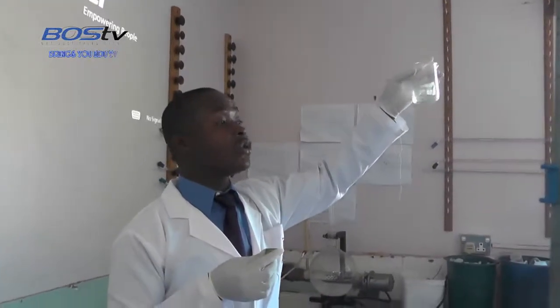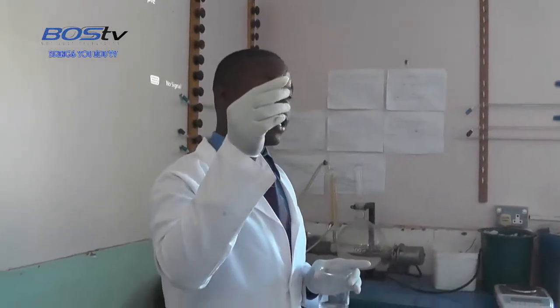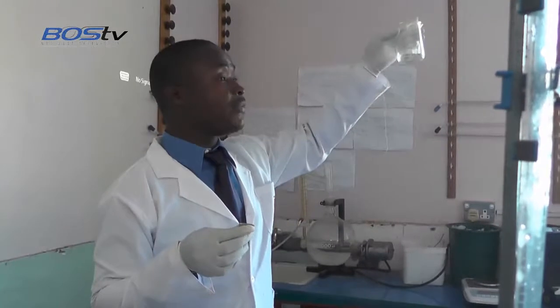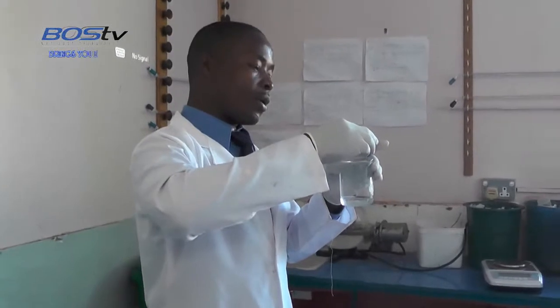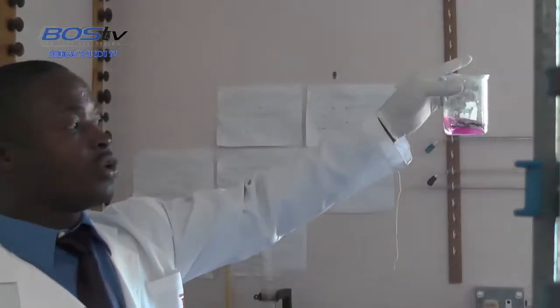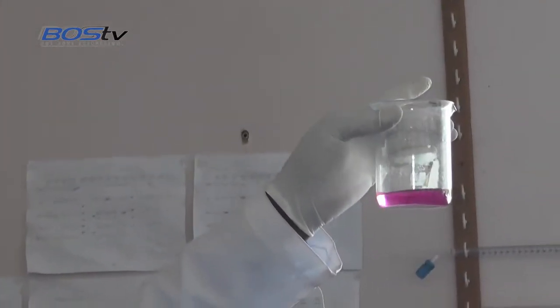Let's focus here. This is water. Now as long as there's some Fe2+ and we add MnO4 minus, it is going to react and produce a colorless solution. But if all the Fe2+ has been used up in the reaction and you add more MnO4 minus, a single drop is going to produce a permanent pink color, because if you disperse your deep purple, you produce this permanent pink color. So this is going to be our endpoint of the reaction. Okay, we may start the practical.